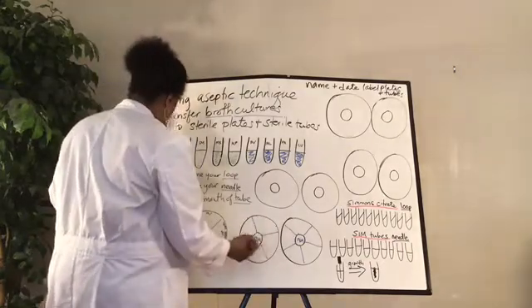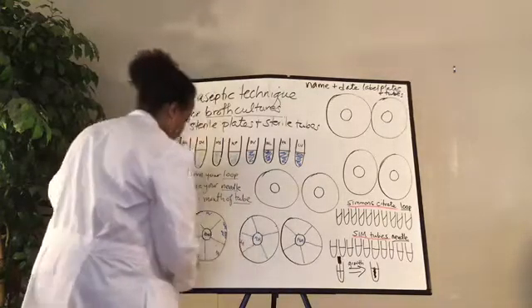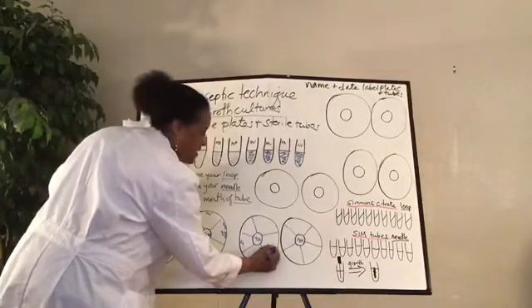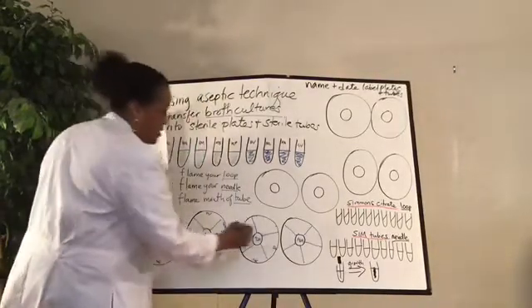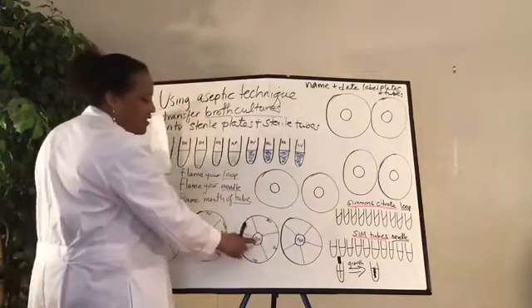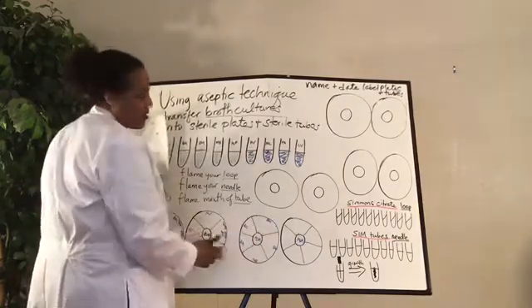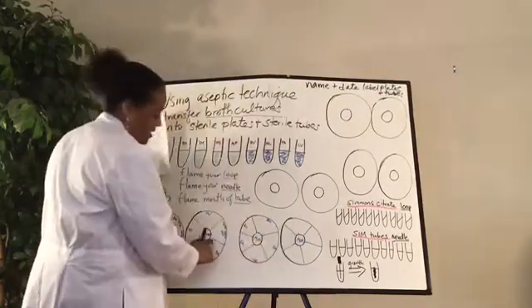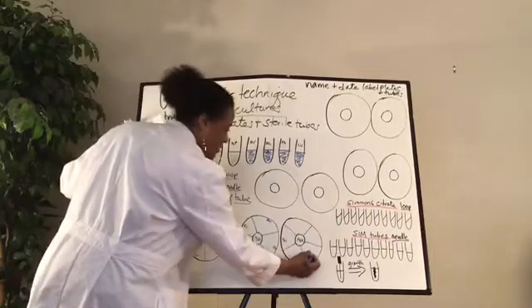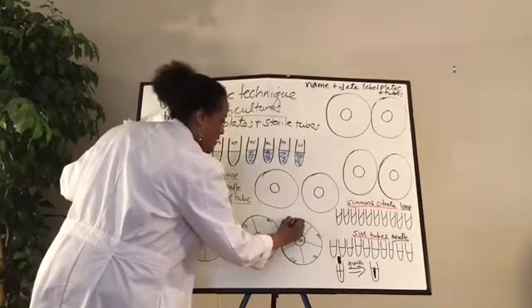So this one's the same. It would be SA here, just like the SA is over here. So what goes here? MS, correct? SM. Same thing as this one. BM, and then EC. This is a different agar though. This is MSA. It's not BA. It's not the blood agar. This one will match this one. So we see the KP is here, the CV, the PA, the ML, and the PV is here.